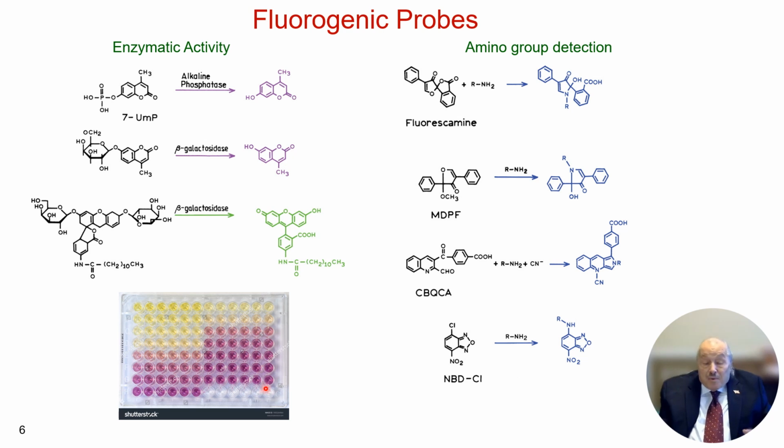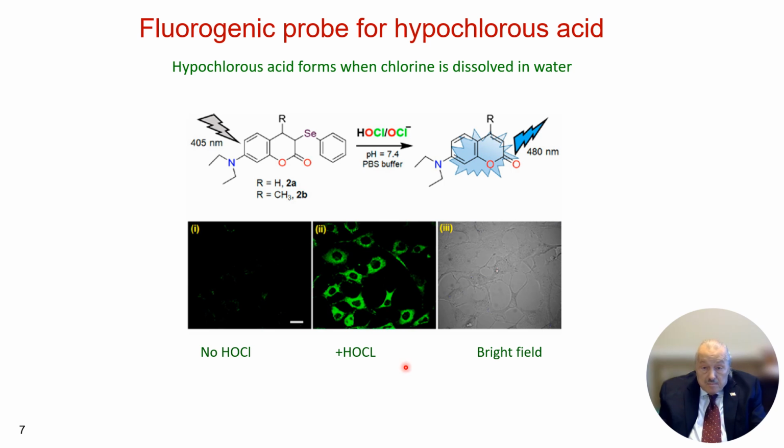I couldn't find a fluorescent one, but I found this one that changes colors, which is due to some type of chromogenic reaction rather than a fluorogenic reaction, but that's a typical enzyme activity probe.